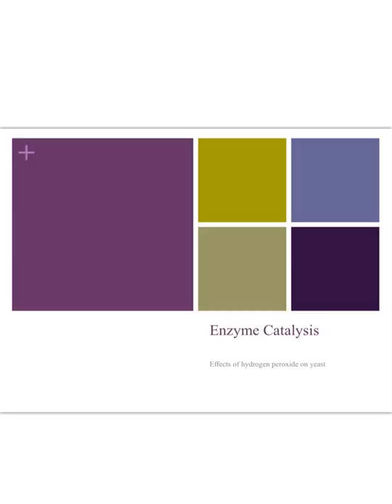Okay, for this week's lab, we're going to be looking at the enzyme catalase. This is an enzyme that is found naturally within animals. And what you need to know is a little bit about enzymes in general. So we're going to go a little bit over what an enzyme is, why they're important, and then the importance of catalase, product, substrate, and your enzyme.